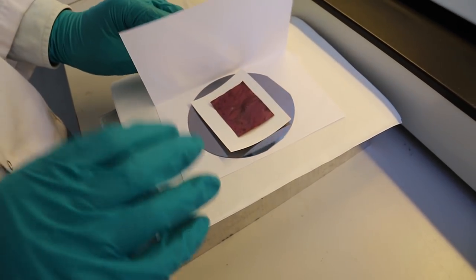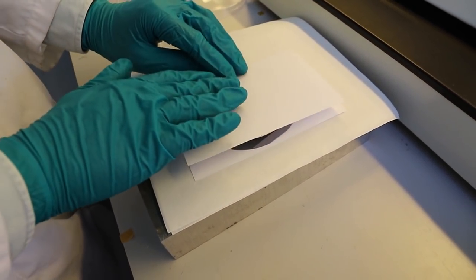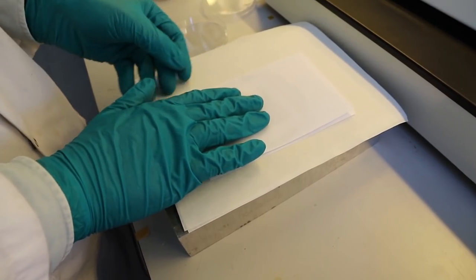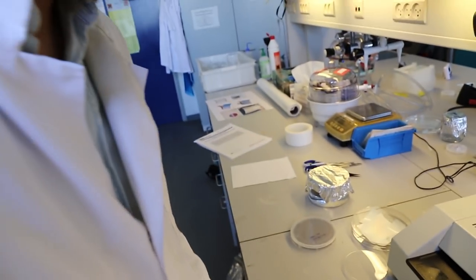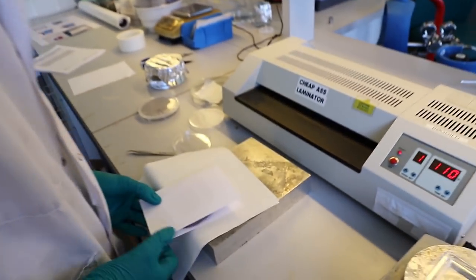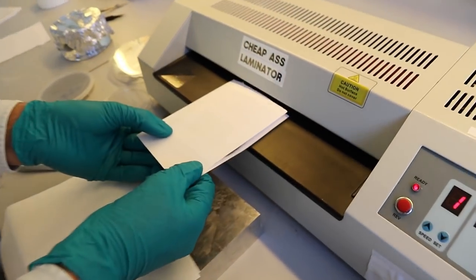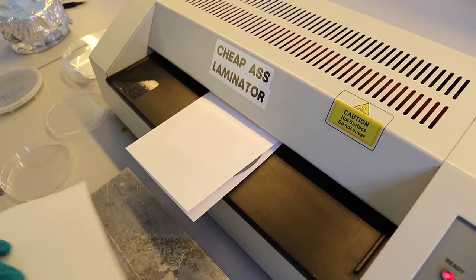Then we enclose it in an A4 sheet of paper because we want to prevent the foil from sticking to the silicon rubber of the laminator. Just stick it through our laminator.